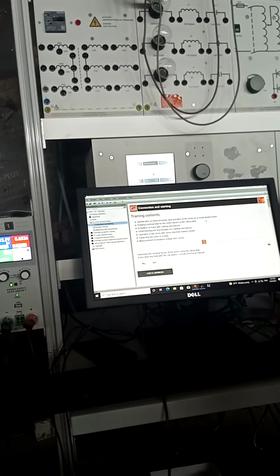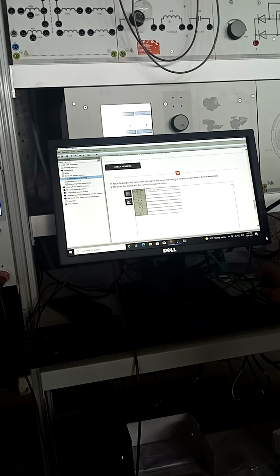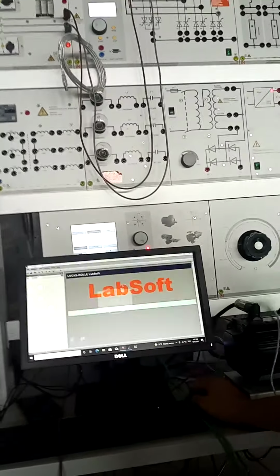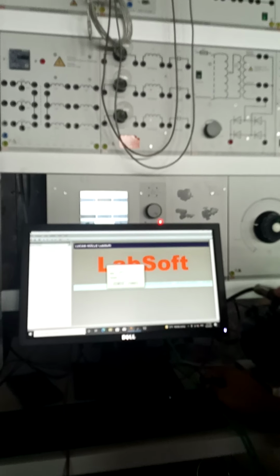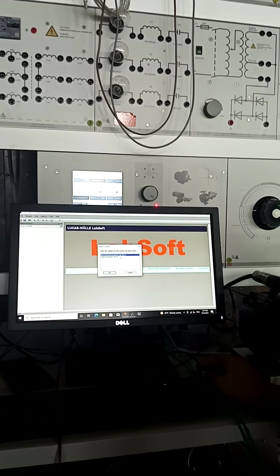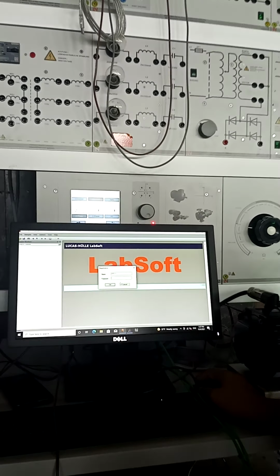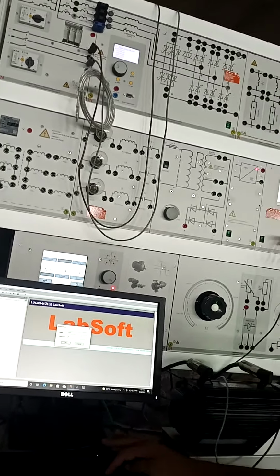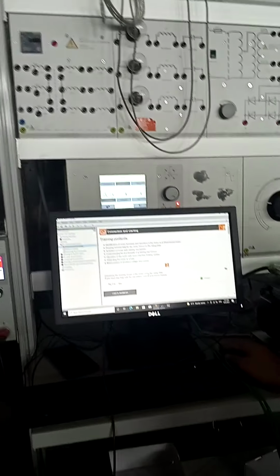No answers, no solutions. Okay. I can check another one again. You have to filter also. Look here. What is the code? Oh, sorry. Cancel. The code was 1, 2, 3.